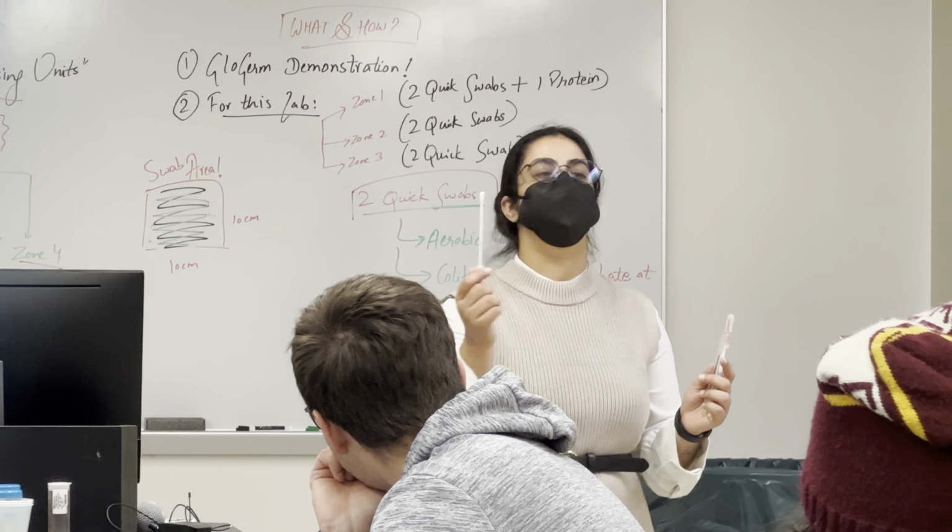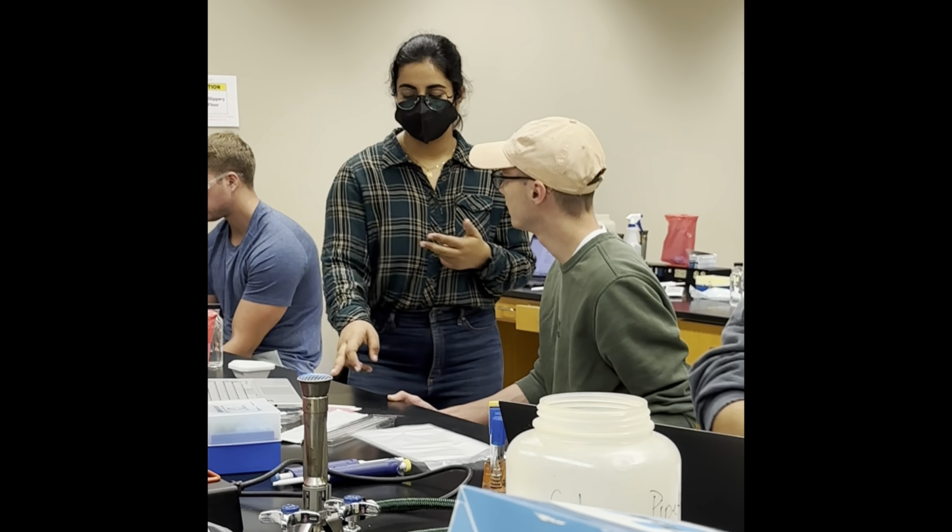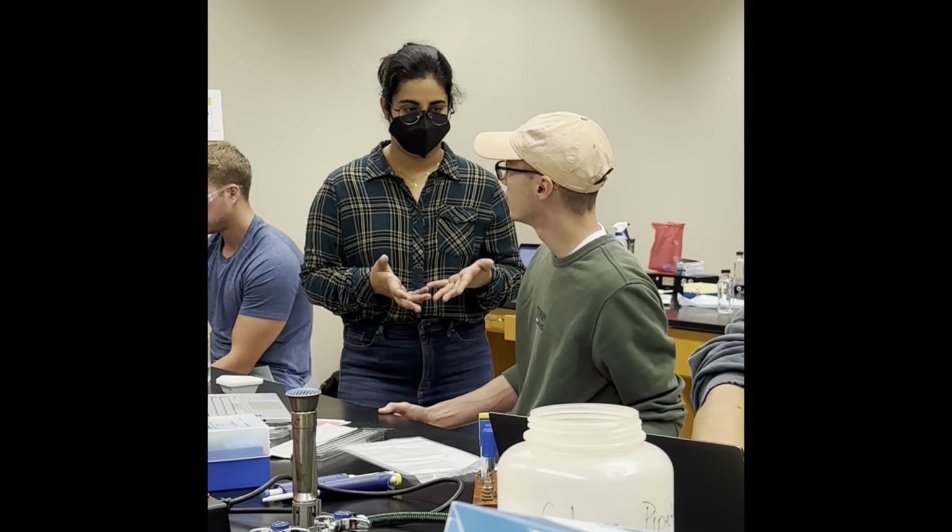Any questions? Tests today. The first one is the petrifilm. You will deal with the petrifilm for culture as well as your food sample. This is used to detect the coliform specimens, right?